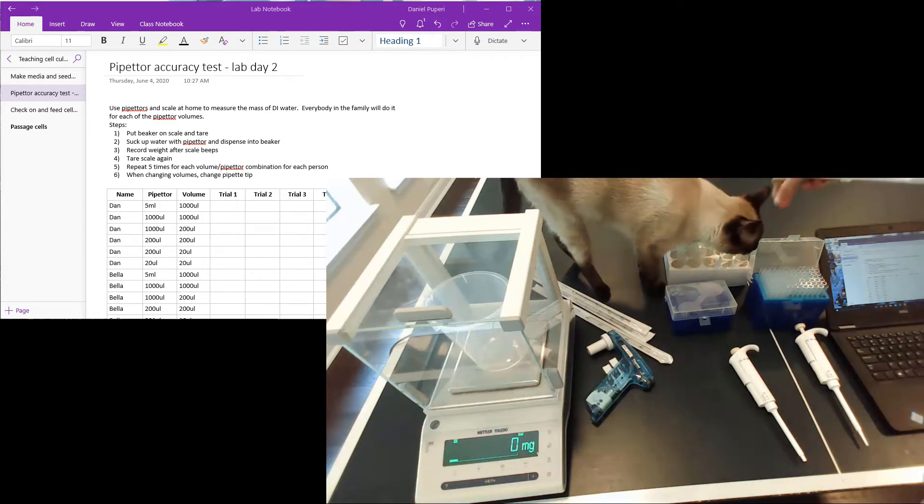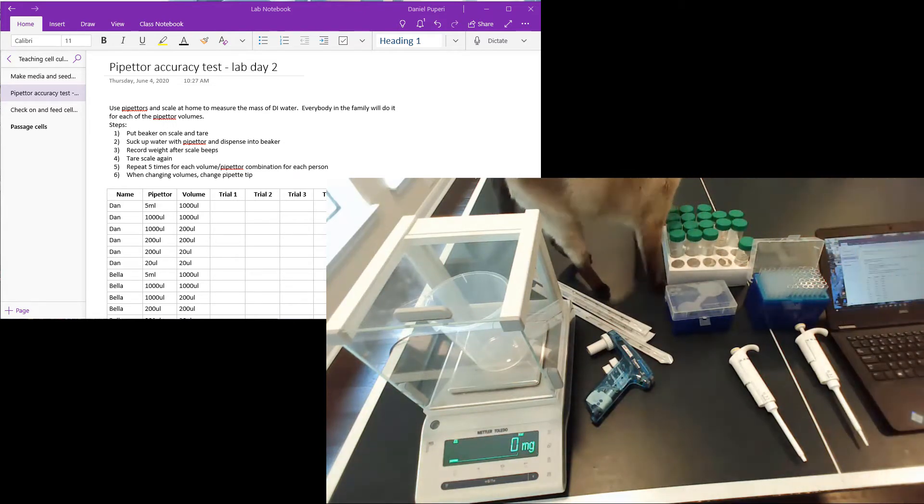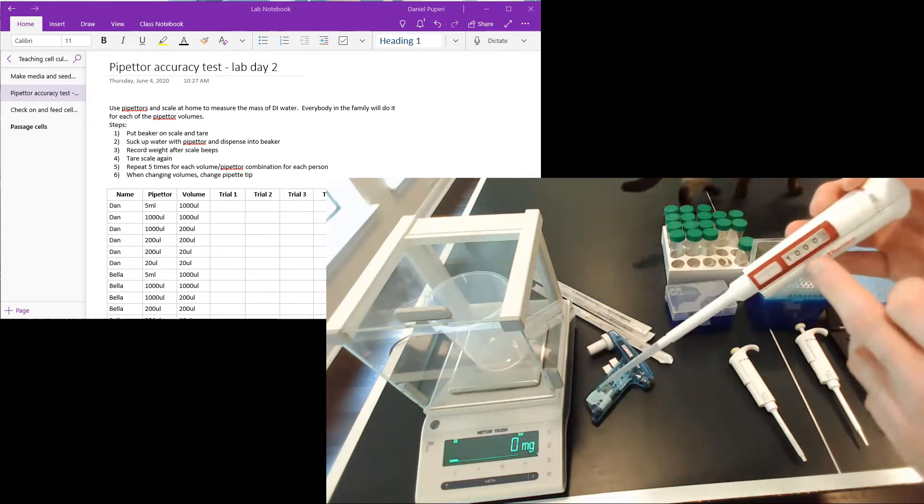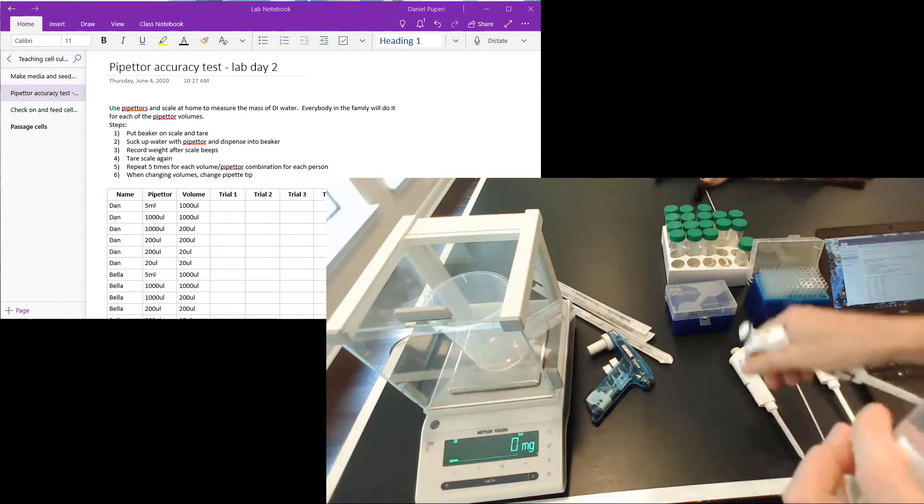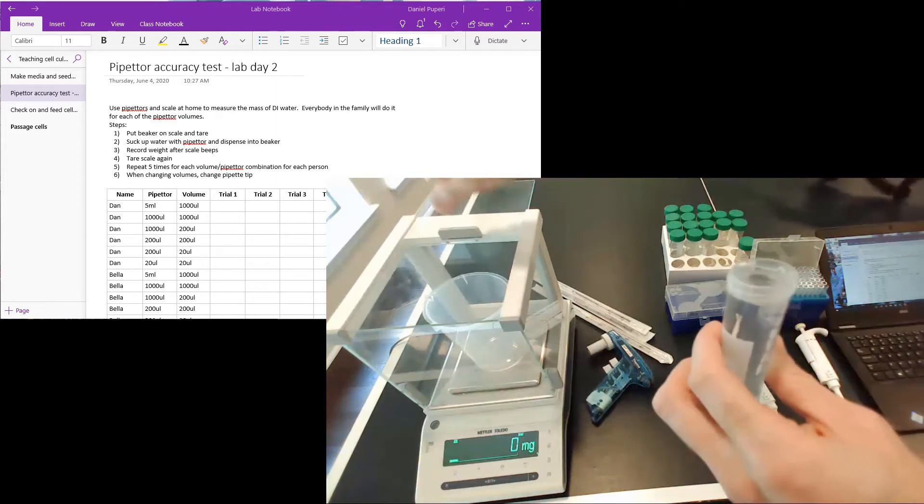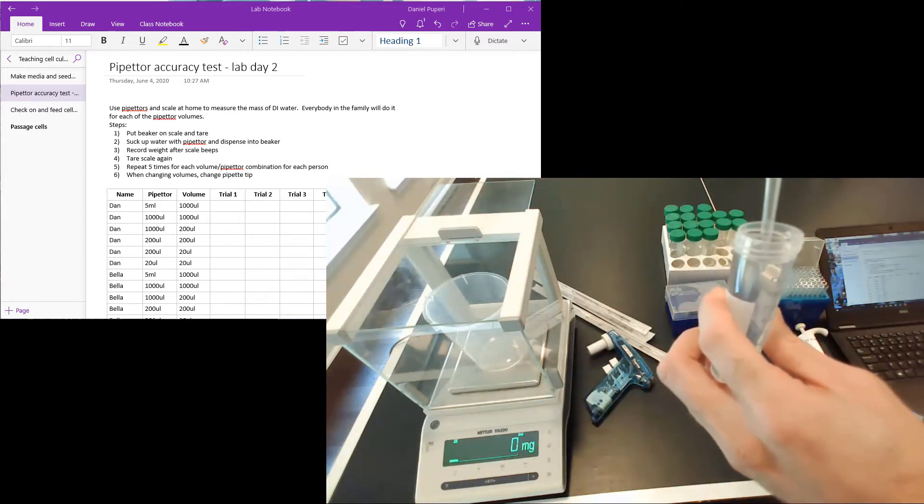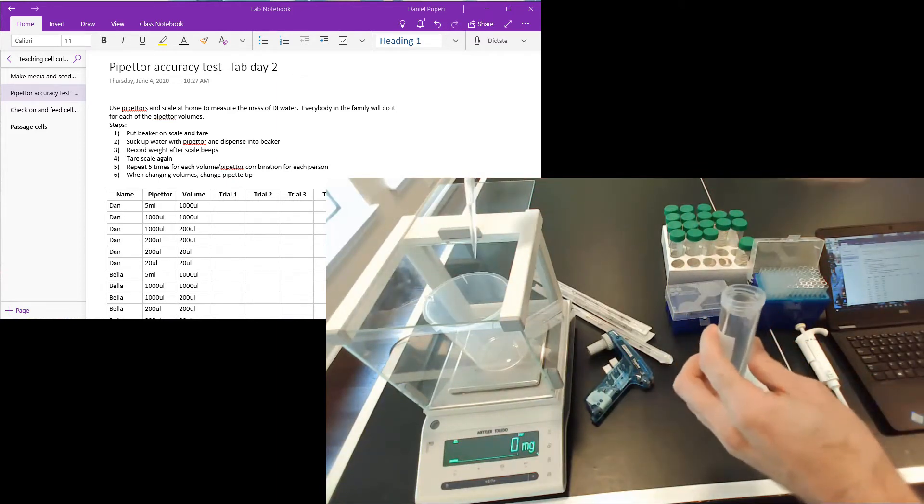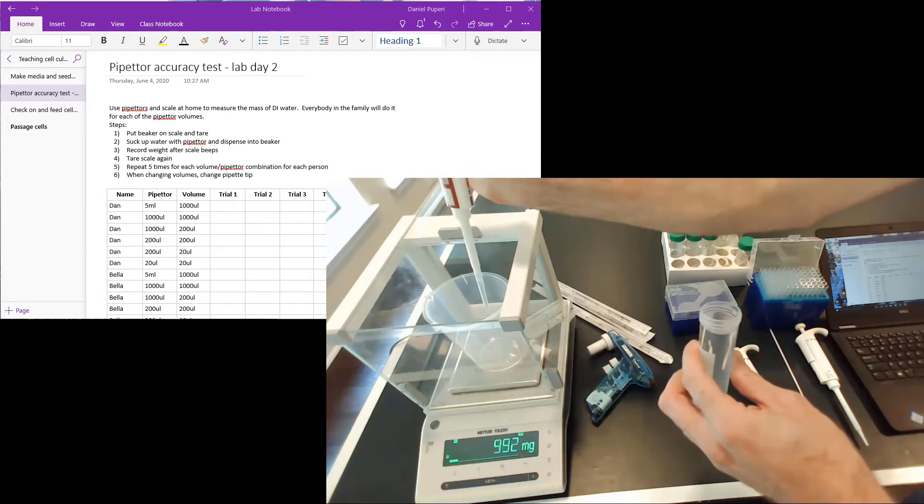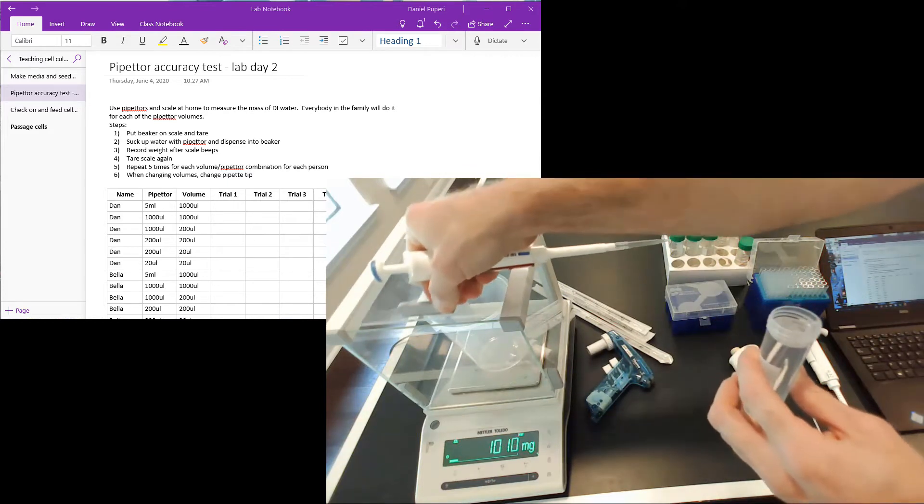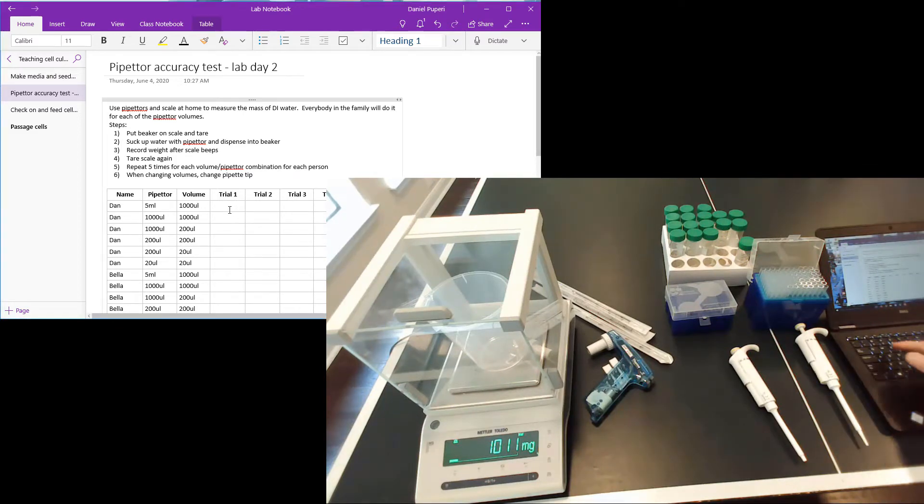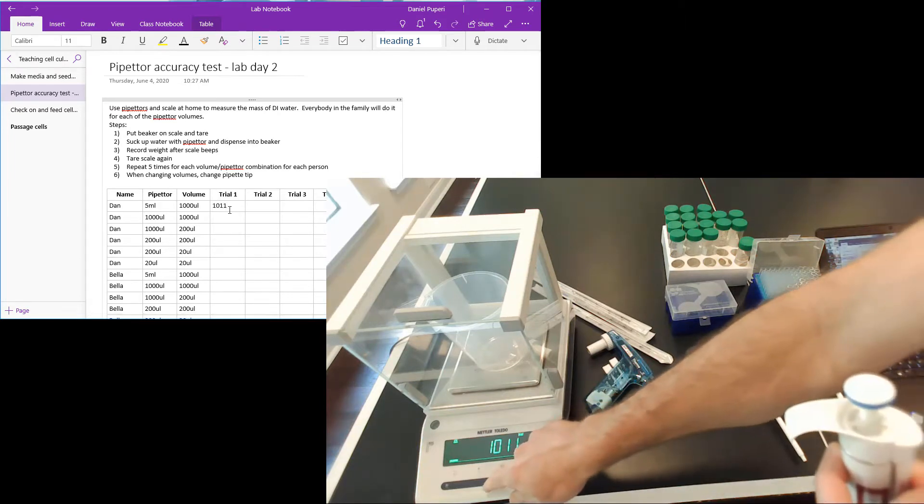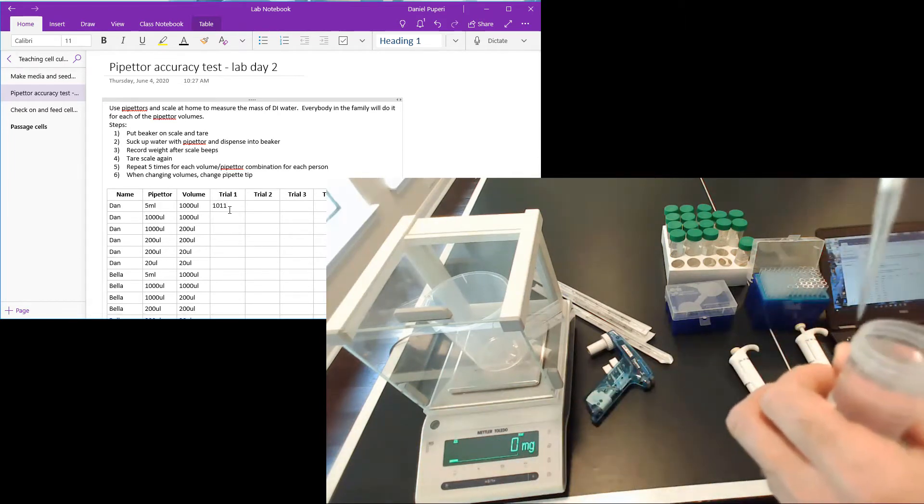So we're going to add the thousand microliters of water using the thousand microliter pipetter. All right, so take that measurement, type it in, tare it, and we do this again.